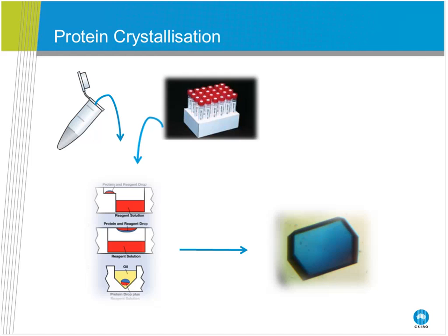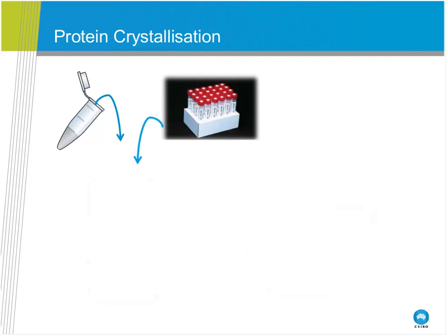And if anybody is impressed by my blue crystals, you can do this at home too. That's blue food coloring from the supermarket mixed with lysozyme. All right, so moving on.